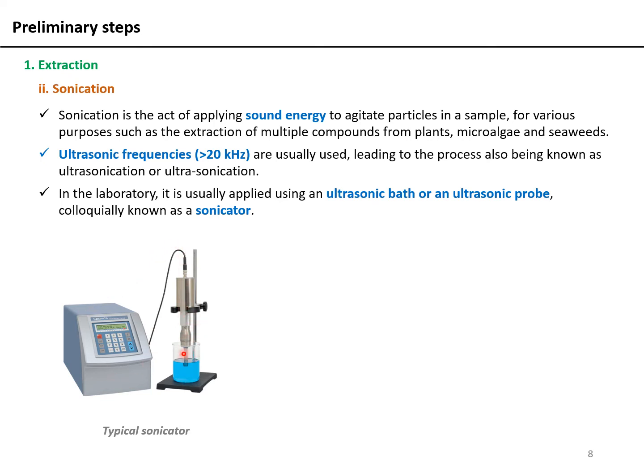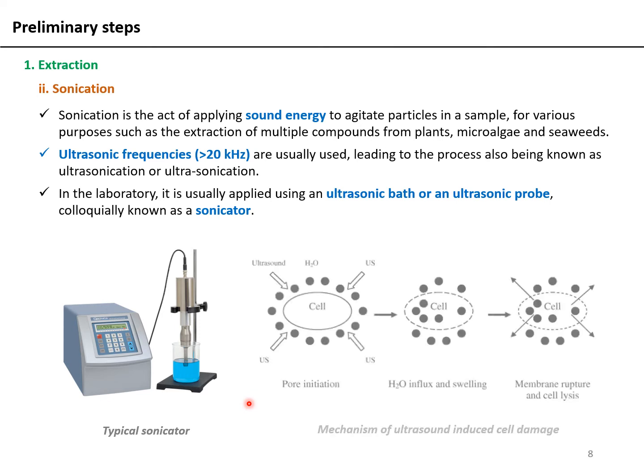So this is your sonicator probe which is immersed in the solution, or rather in the cells suspended in the lysis buffer. Also keep in mind that it's preferred that the probe is immersed 3/4 of the way into the cells resuspended in the lysis buffer to ensure the most effective and efficient sonication. But do be careful that this sonicator probe does not touch the bottom of your glass beaker, because otherwise your beaker would simply crack. Yes, I forgot to mention, all of these sonication procedures are carried out in glasswares and not in plasticwares.